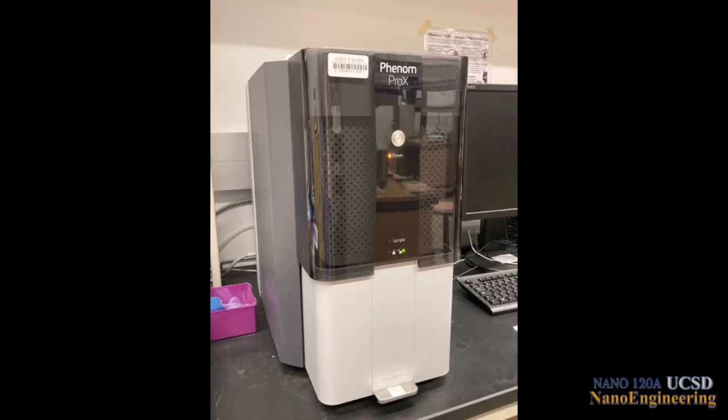The Phenom Pro-X has three accelerating voltages: 5 kV, 10 kV, and 15 kV. Higher accelerating voltages result in larger sampling volumes by the beam due to its greater penetration into the sample. The choice of accelerating voltage in scanning electron microscopy can depend on several items, such as the sample sensitivity to the beam, its conductivity, what types of electrons we are using to image—for example, secondary electrons or backscatter electrons—and also on our need to provide enough overvoltage for X-ray excitation when doing EDS analysis.